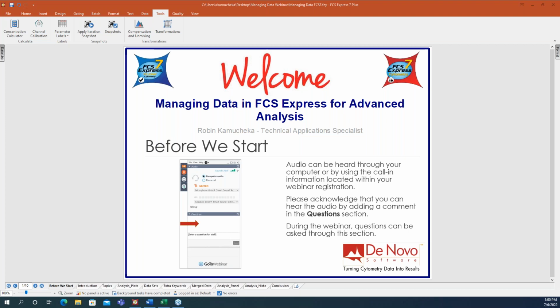So I am Robin Kamucheka, Technical Application Specialist with Denovo Software, and I'm joined today by my colleagues, Greg Beltry and Holly Bonar. And today we're going to be covering managing data in FCS Express for advanced analysis.